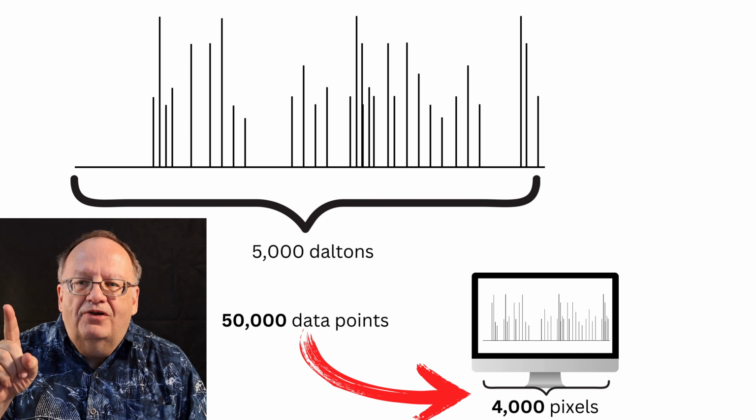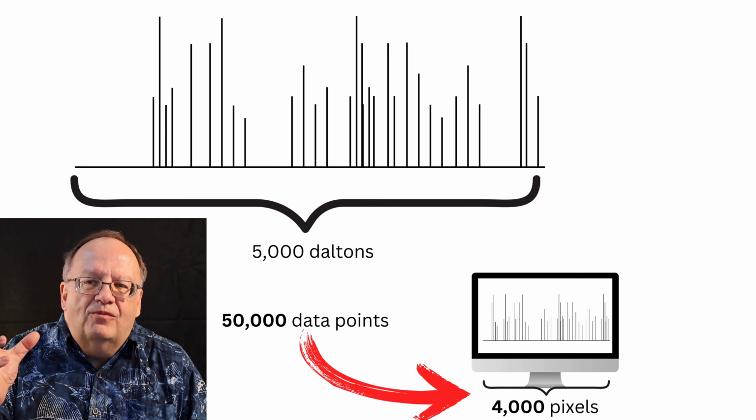If you just measure and report, I've got an almost insurmountable problem of how to make sense out of this data. Now, we do have tools that are trying to help us find the things that are of interest to us. The most common technique is to find the ones with the most abundance, the high spikes. That's a relatively easy algorithm to implement and not necessarily the right one. The things we're looking for that actually answer our biological questions are not always the highest spikes. So we've got to have something better.